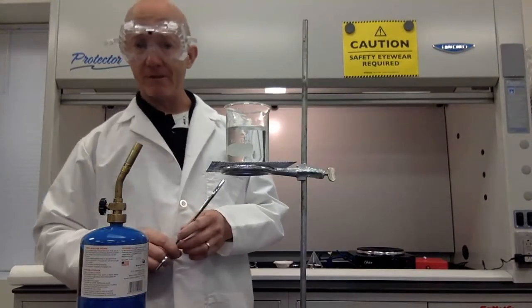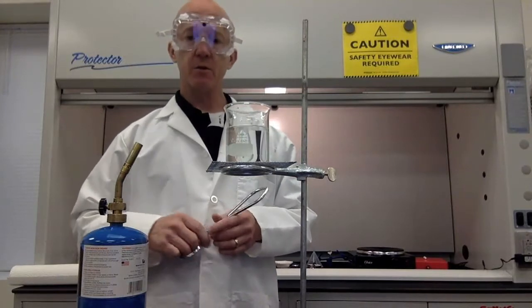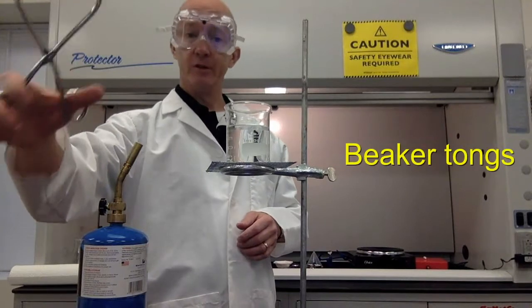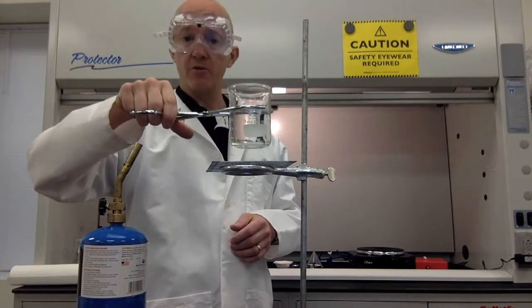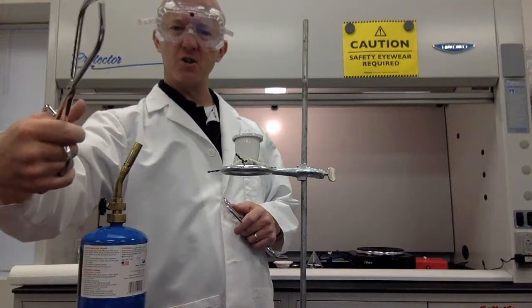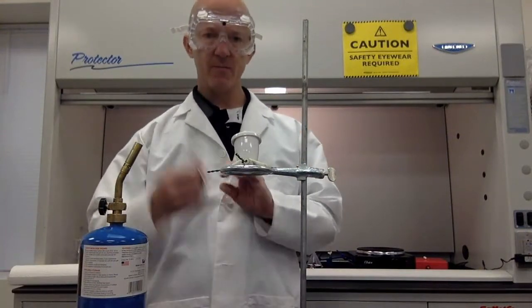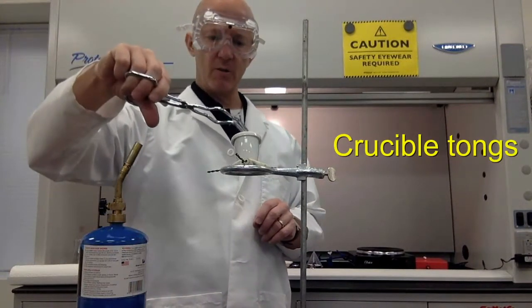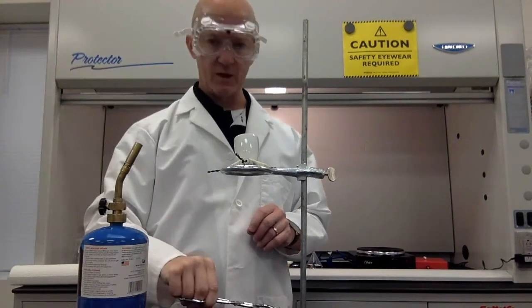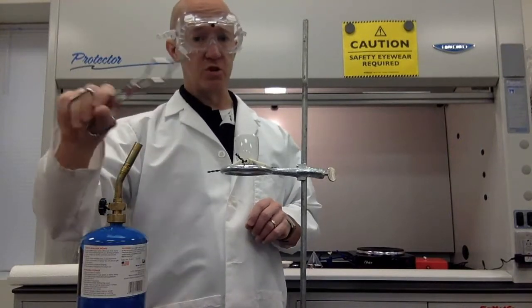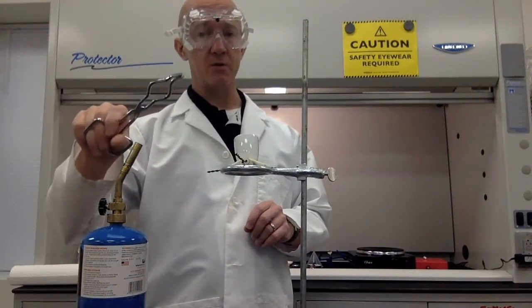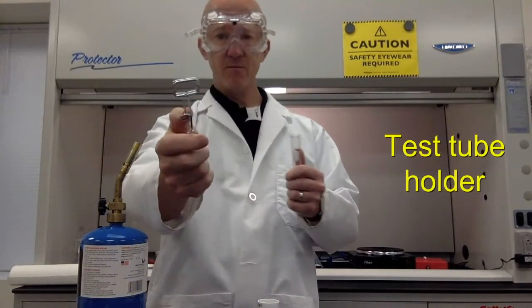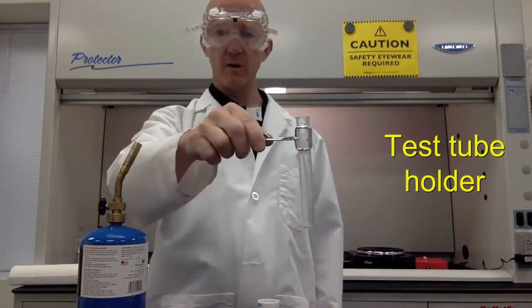Now we certainly don't want to burn our hands while we're taking things on and off of heat. So we have things like this. These are beaker tongs used for transporting hot beakers. But beaker tongs aren't the right size for crucibles. So instead we use crucible tongs. A little bit more narrow. And we can do things like pull the lid off the crucible if we need to. Crucible tongs should not be used to transport hot beakers. But crucible tongs are too big for test tubes. That's why we have test tube holders. There you go.